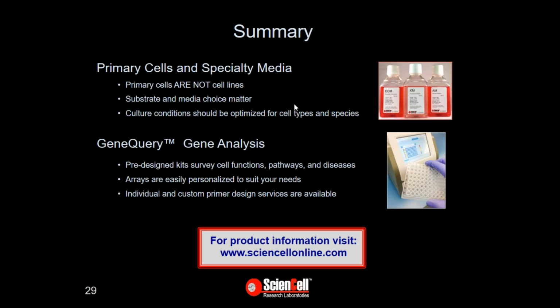Do we have specific tips for transfection of primary cells? That depends on what cells you're using. It's different for different cells because some cells are more sensitive to transfection than other cells. For instance, endothelial cells are kind of well known for not being fantastic at being transfected or infected, but epithelial cells, I think they're a little bit hardier, so they can take it more.